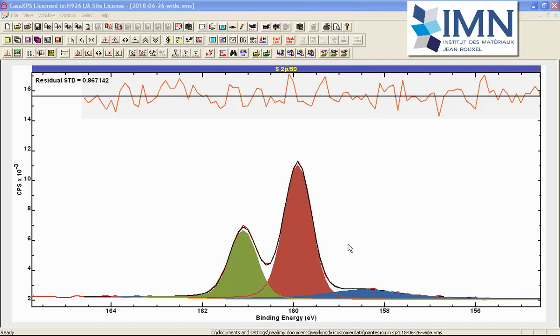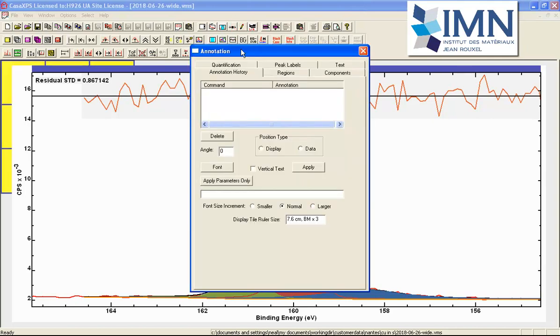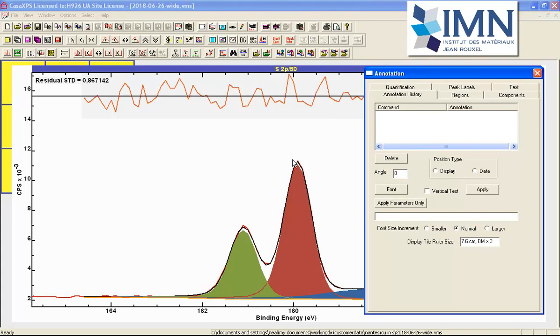In this video, we will look at how the full width half maximum of this Gallium 3s peak — when we adjust it and then refit these data — influences the position of these peaks and the area of these component peaks. The first thing I will do is add an annotation table that will help to understand this peak model.